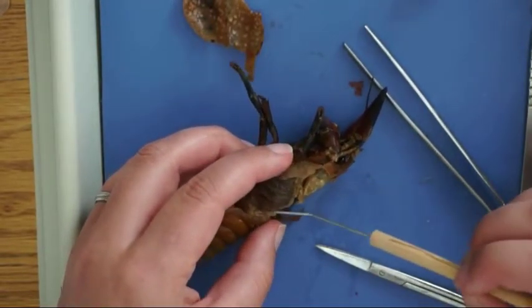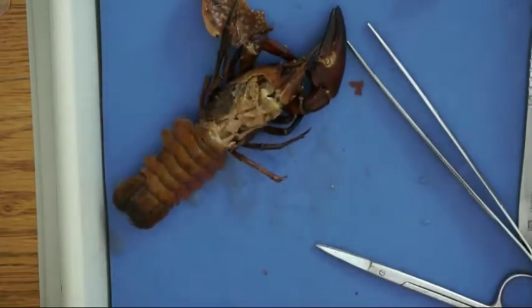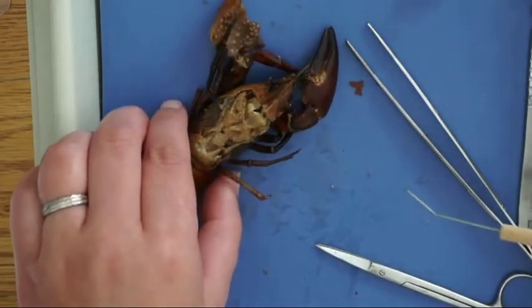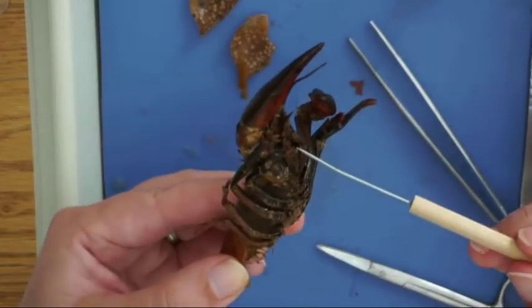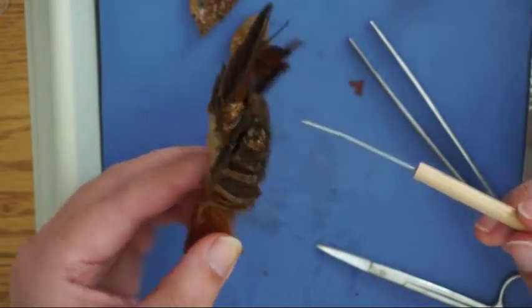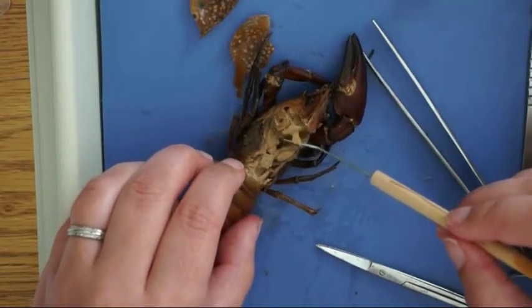These are the gills — dark colored, feathery, and they're right above the walking legs. So when the legs move, oxygenated water is forced over the gills and can pass and diffuse right into the bloodstream. And then this is the mouth, as a reminder. The mouth is on the underside, and it feeds into the stomach, which is right here.